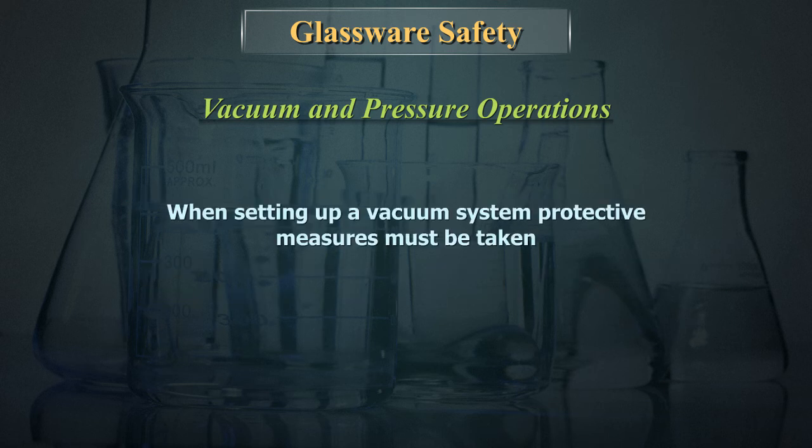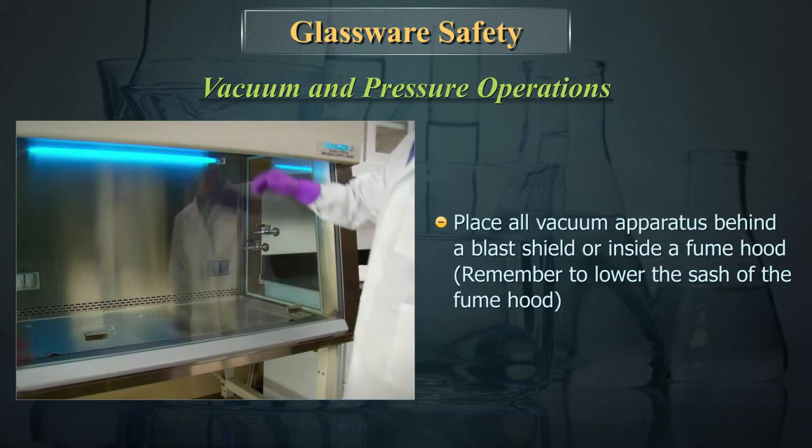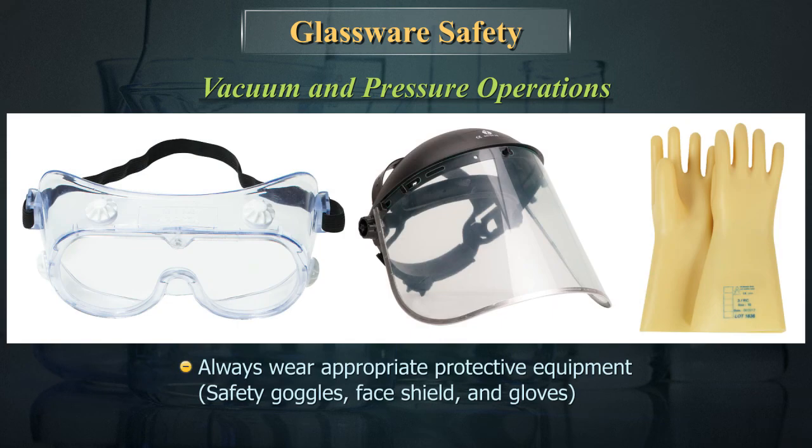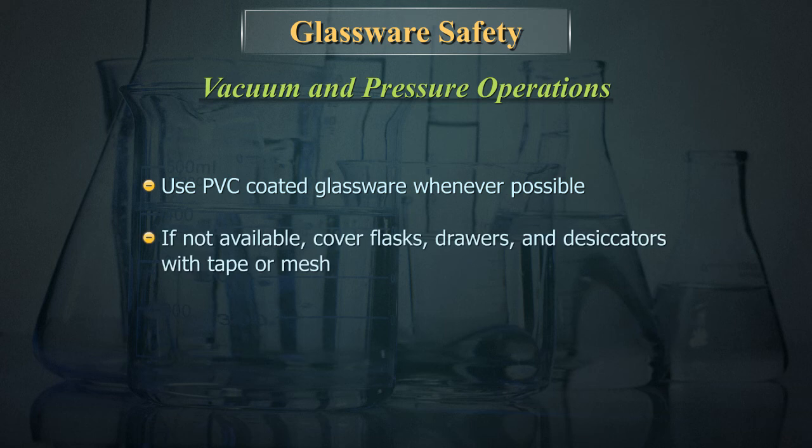When setting up a vacuum system, protective measures must be taken. Place all vacuum apparatus behind a blast shield or inside a fume hood, and remember to lower the sash of the fume hood. Always wear appropriate protective equipment: safety goggles, face shield, and gloves. Use PVC-coated glassware whenever possible. If not available, cover flasks and desiccators with tape or mesh.